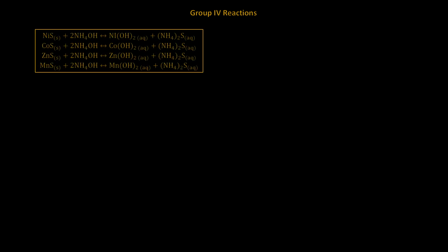The precipitate in the number 4 test tube consists of the group 4 elements. For confirmation, these elements need to be separated. To the test tube, ammonium hydroxide is added. Sulfides do not dissolve easily in hydroxide solutions. The sulfide, as shown, will break down to form hydroxides.